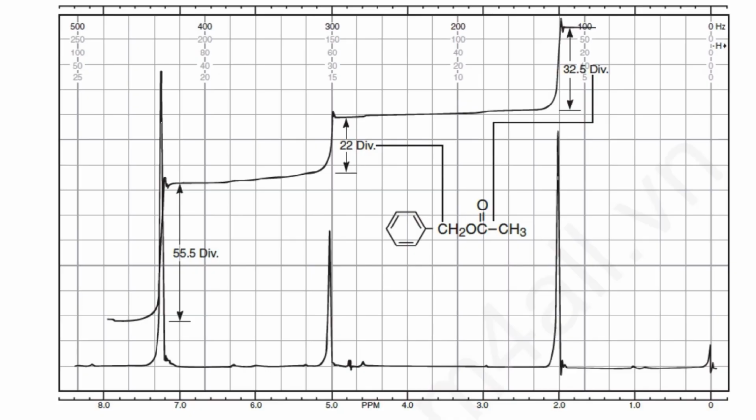As we have discussed in the mechanism, the peak which is attached to the electron withdrawing group will be towards the higher ppm value, whereas the one attached to electron donating groups or in a highly shielded area will appear at a minimum chemical shift value or ppm, and this is the peak of TMS or tetramethylsilane, which is our internal standard.